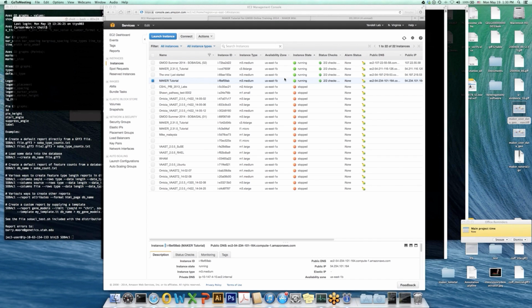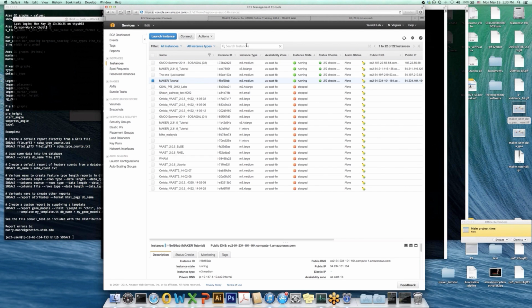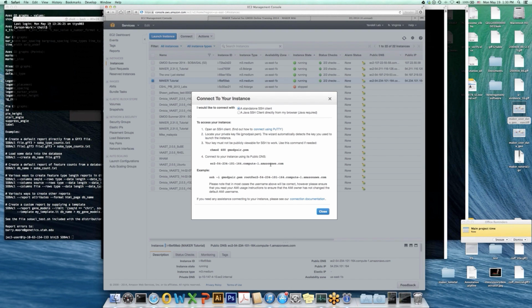Okay, and once you have your instance, if your instance is launched, this should say running, and you'll have your status checks, all 2 of 2 checks, completed. And if you select your instance, you can hit connect to get the information on connecting to that instance. So to make your key private, chmod 0400, and then the key's name is the command you would use. I've pasted it into the comments.